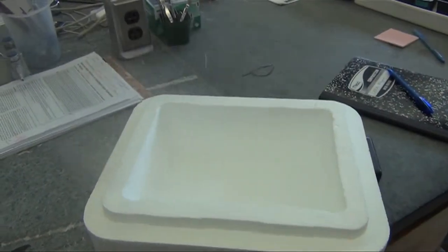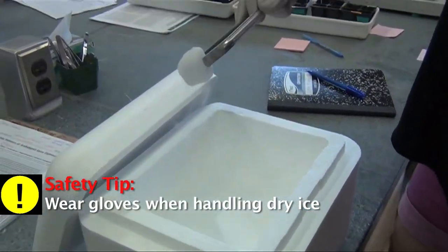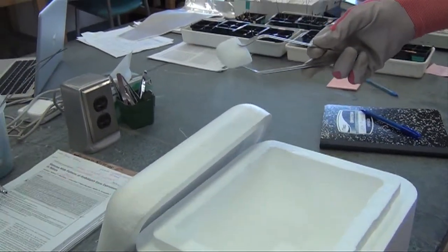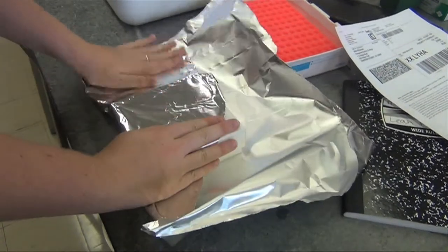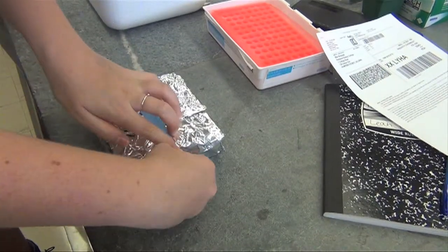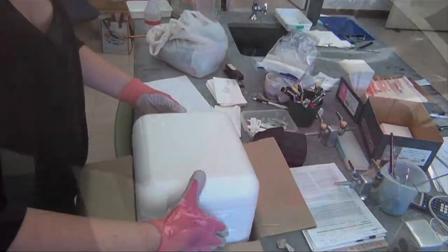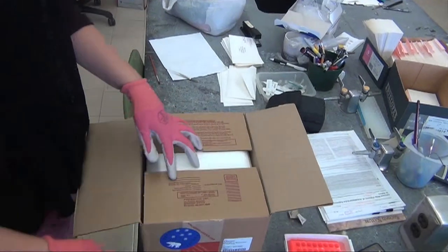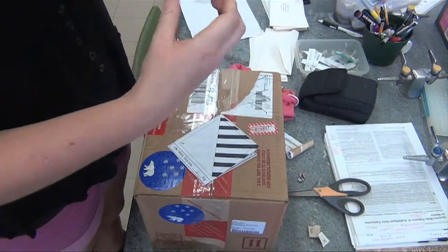Generally, you will take a styrofoam container and add pieces of dry ice — here we are using 2 kilograms. Secure your tubes inside their box by adding paper to fill in the empty space. Then wrap the box in plastic wrap or tin foil, and secure it with tape so the tubes don't go all over the place. Place the styrofoam box into a cardboard box and attach the appropriate labels and warnings. Please remember to check with your lab's safety guidelines before you send any of this material.